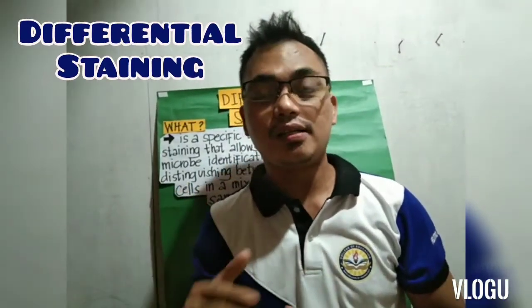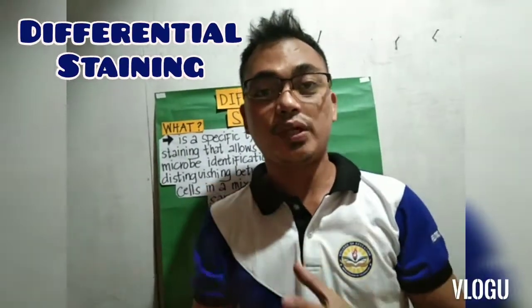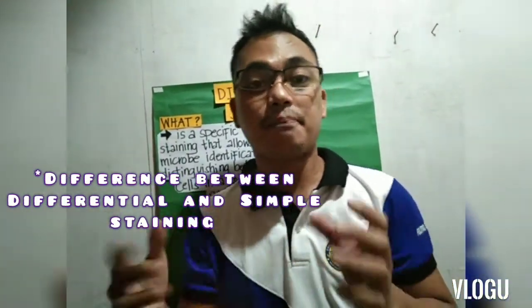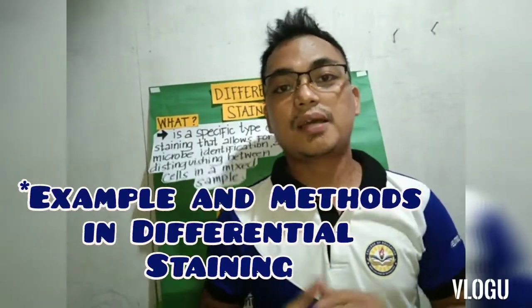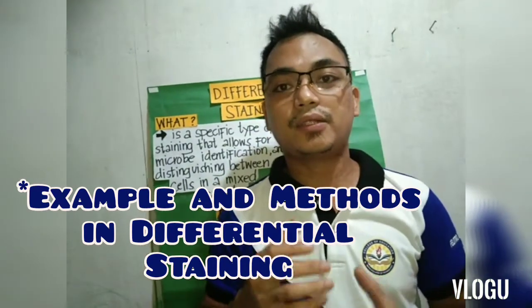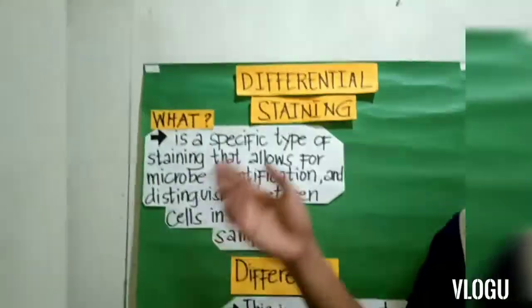Guys, today we will discuss differential staining and the difference between differential and simple staining. Also, class, we will learn the examples and methods of differential staining. Okay, class, what is differential staining?